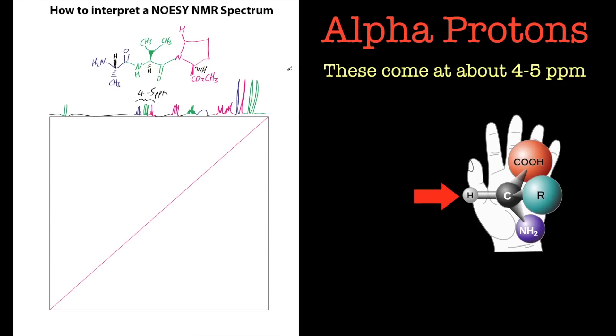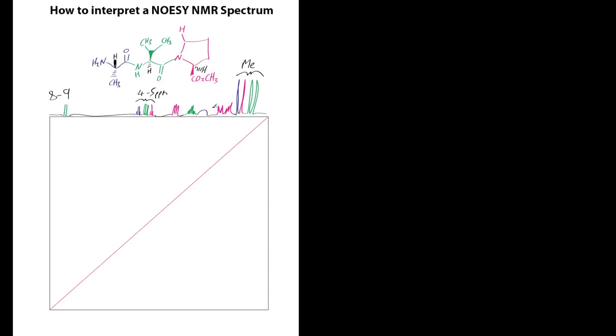Another one to identify would be this NH proton, this amide proton. They come between 8 and 9 ppm, so they're really easy to spot. Also, we've got some methyl protons here. Let's call them ME. They come between 1 and 2 ppm, so they're easy to spot.